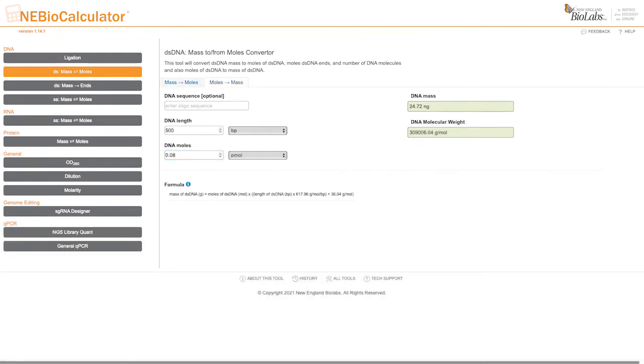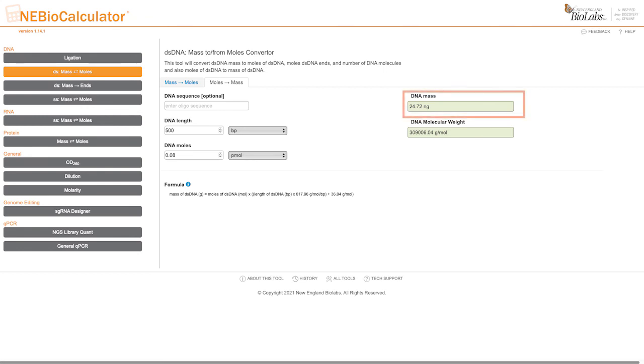Now that we have the correct quantities of DNA fragments to add to our assembly, we can use the insert fragment lengths to calculate the mass of each insert DNA to add to the NEBuilder assembly reaction. By entering fragment length and moles, NEBioCalculator indicates we should add 24.72 nanograms of the 500 base pair fragment and 98.87 nanograms of the large 2 kb fragment.